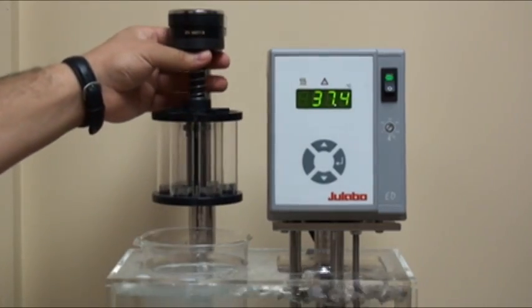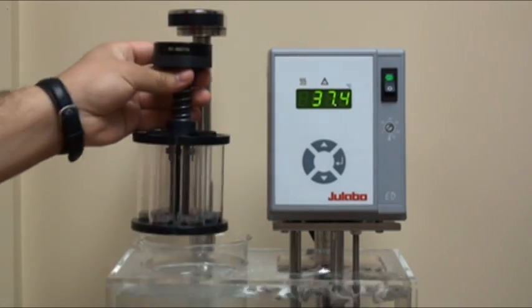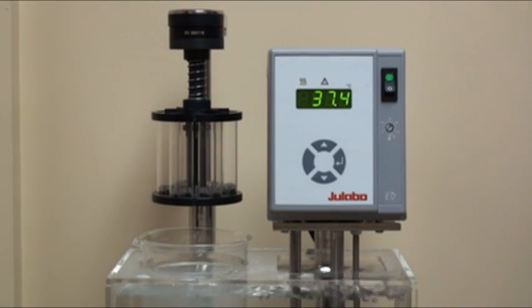The Dissi is very simple with the magnetic, contact free, patented IRL baskets.